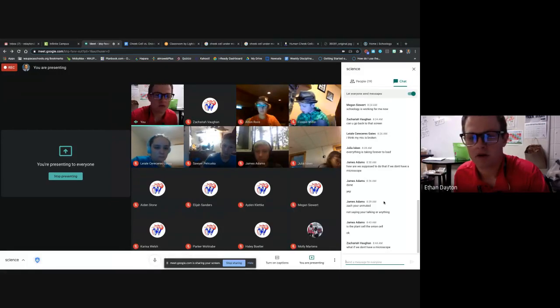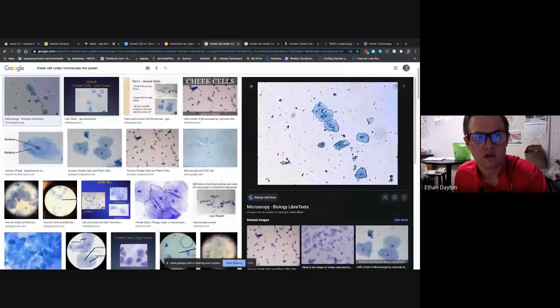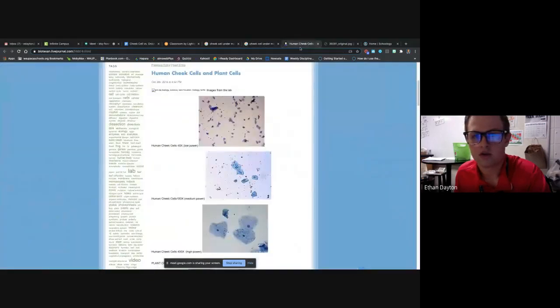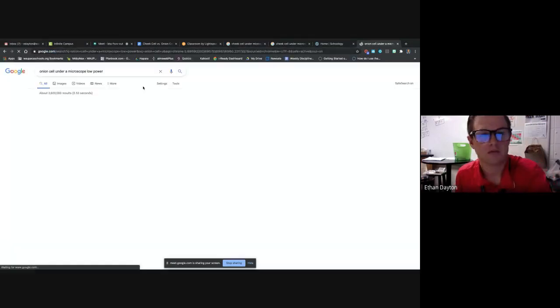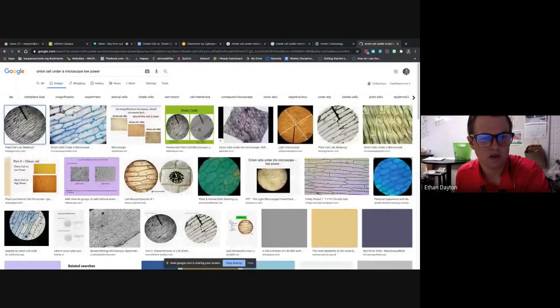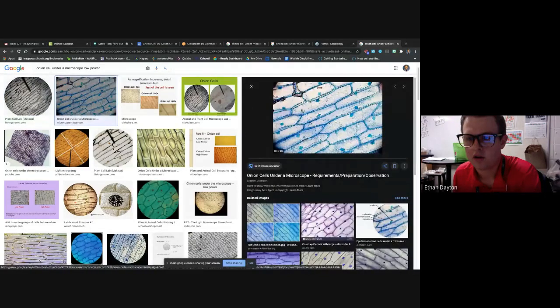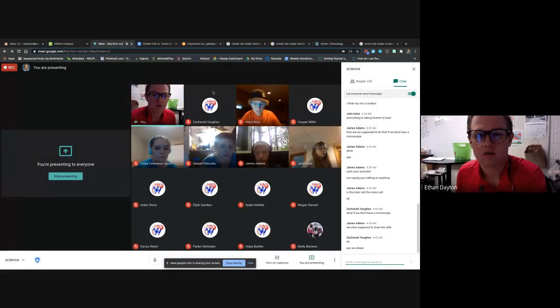Zach, you don't need a microscope, bud. I just did it on the microscope, and you could now do this. Look what I did. I Googled a cheek cell under microscope, and an onion cell under a microscope. There we go. All right, does this look like what we saw right here? Kind of, right? Theirs is a little clearer. Does this look like what we saw, Zach? Yeah, that looks like what we saw. Cool. So if you have trouble drawing what we just saw, I know it was quick, you can use the internet as well.